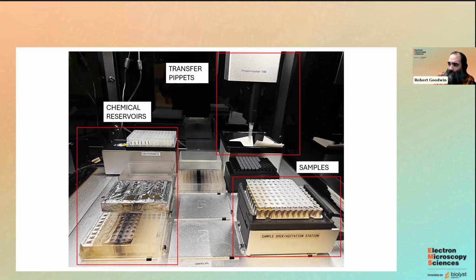Sometimes you'll get a little air bubble that you have to tap out. For instance, the renal biopsies have to be in a certain orientation, and muscle has to be in a certain orientation. For those, I orient them once I embed them.